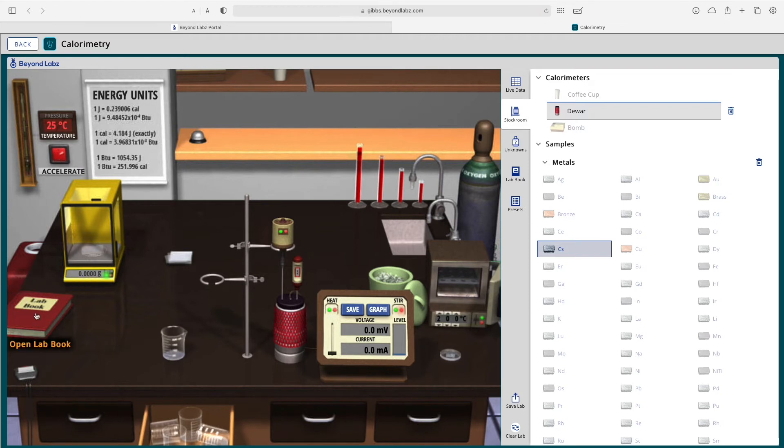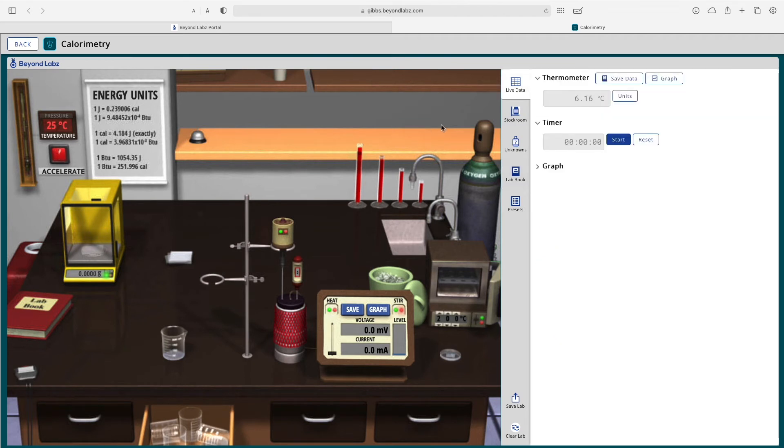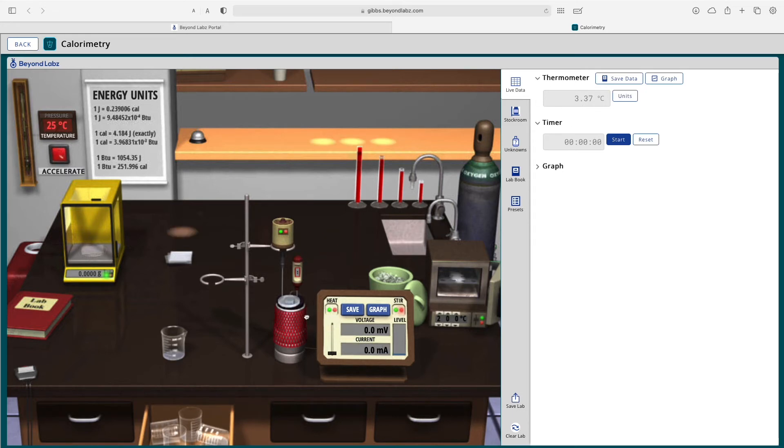There is a lab book on the benchtop that will open up the lab book over here. There is a timer on the benchtop that opens up our timer on our live data screen. There's a thermometer that's being read in the calorimeter.